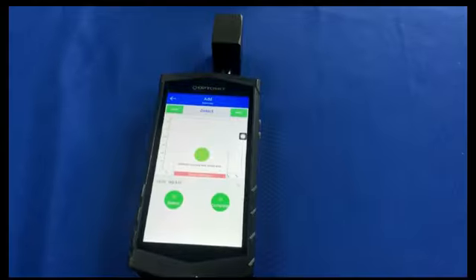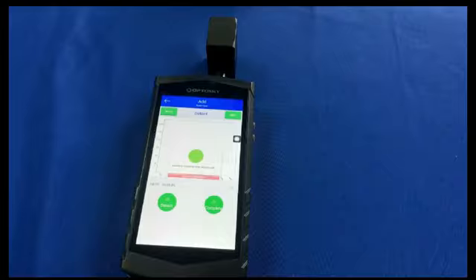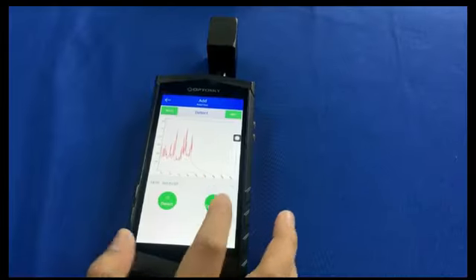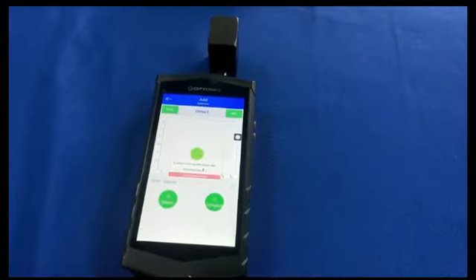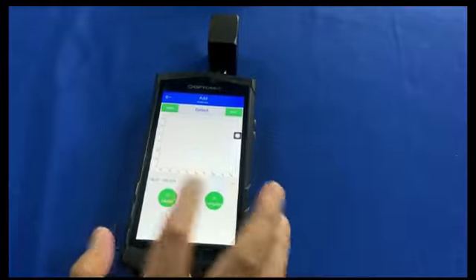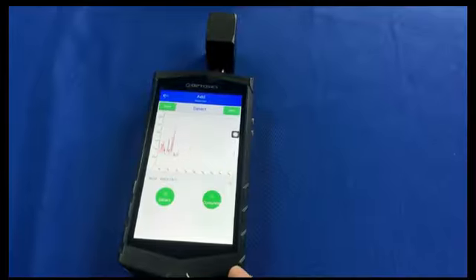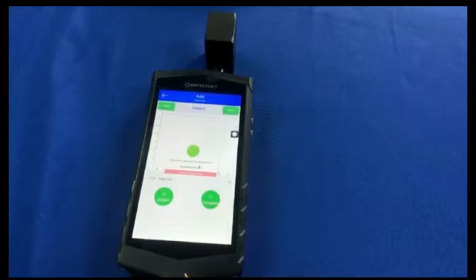After successfully performing the 20 scans, you can press next and input the CAS number. You can input any number, it just cannot be the same. And for the test, you can complete.